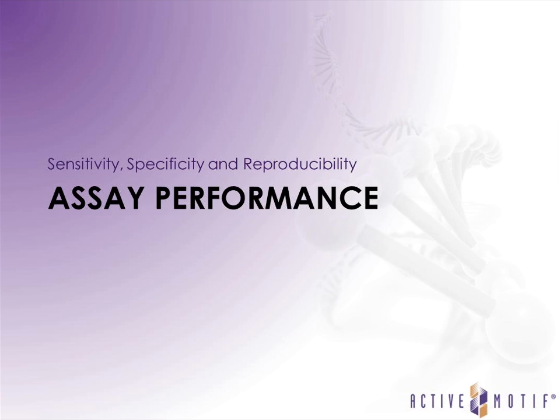In the next set of slides, I will first describe to you how you go about setting up using this assay, and then I'd like to illustrate with a few selected data sets the specificity, sensitivity, and reproducibility of the modification multiplex assay.